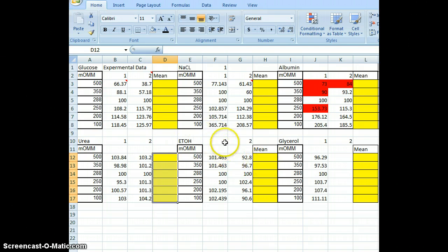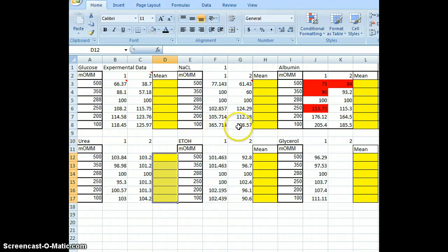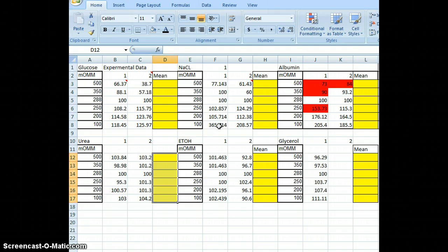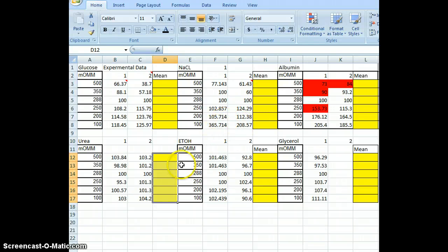If we look at our salt solution — 365, 208 — the percent transmittance went up so much that the red blood cell actually burst. It was flooded with so much water it couldn't stand it and it blew up, and that's going to give us an interesting peak on our graph.